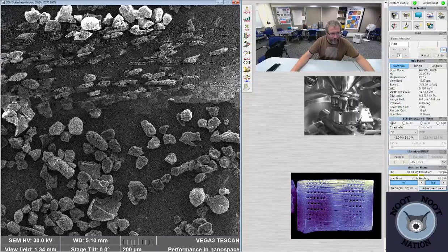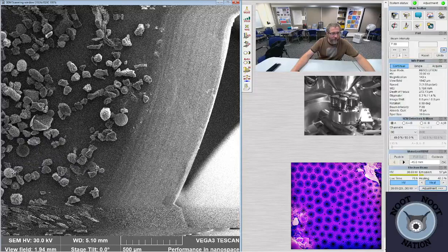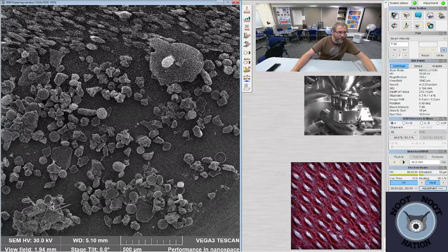Sometimes it's mud samples. Whatever, but I will process them here. That's what I usually do. So, for these marine samples, we usually rinse them, get out the salts, and then process them in nitric acid.